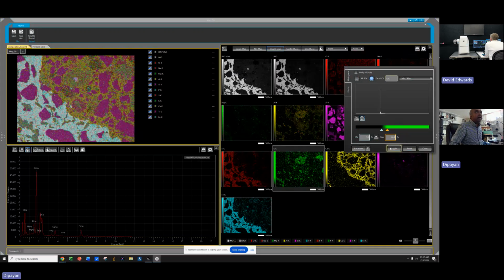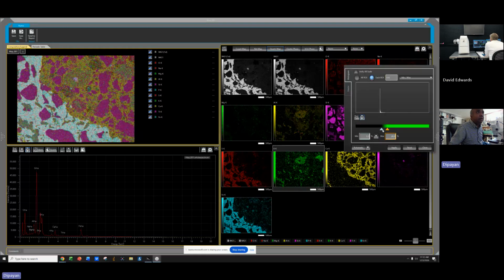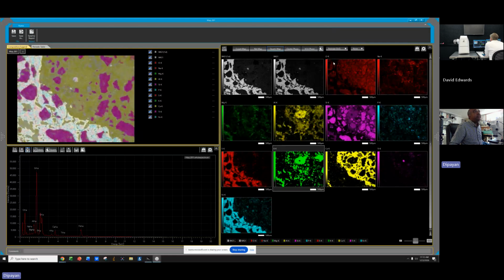Right. So if you want to get rid of some of the noise, bring up that lower arrow just a little bit. Which one is the lower? Oh, this one. Yeah, just bring it up just a touch. And then let go. So you can see some of the noise starts to disappear. Or if I put a filter here, I get a much better image. See, I got your average 3 by 3 or maybe weighted average 3 by 3.